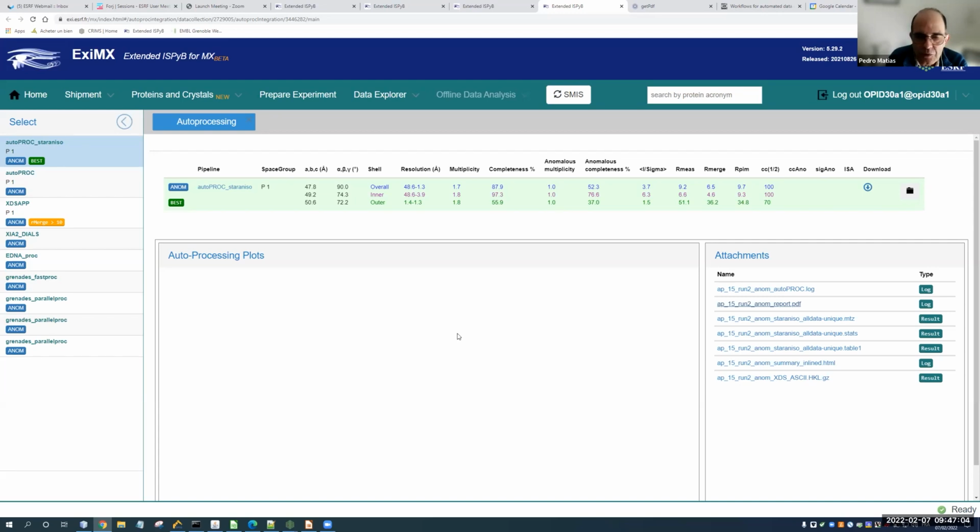So you said the thing about the aimed resolution, that you start at 2 angstrom, and if the crystal diffracts much more than that, you waste the characterization. But how tolerant is the system? For example, if I set the aimed resolution to 1.5 and the crystal diffracts to 1.3, is it enough? Can it just recalculate the strategy based on that and move the detector without having to run a second characterization?